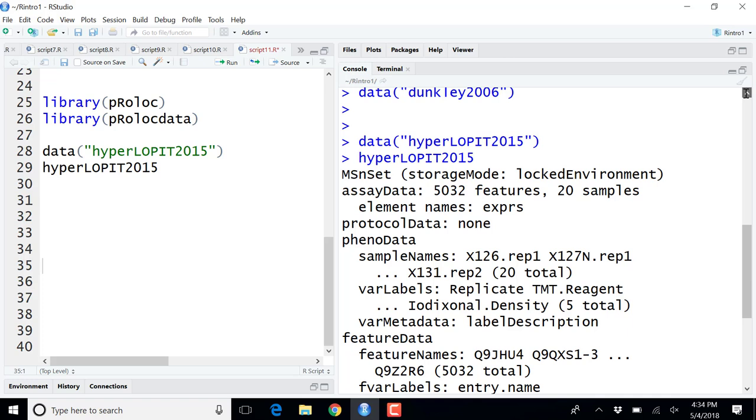Okay. This is a data matrix. Here we have the quantitative information. Here we have additional annotation: each protein has its line with annotation. And we have the same thing for the samples. Each sample here has another data frame with annotation. For example, this is a male, this is a female, female, male, maybe disease, control, this is 1, this is 2, control, and so on. Quantitative information is here on its own, and it has its associated feature metadata and sample metadata.